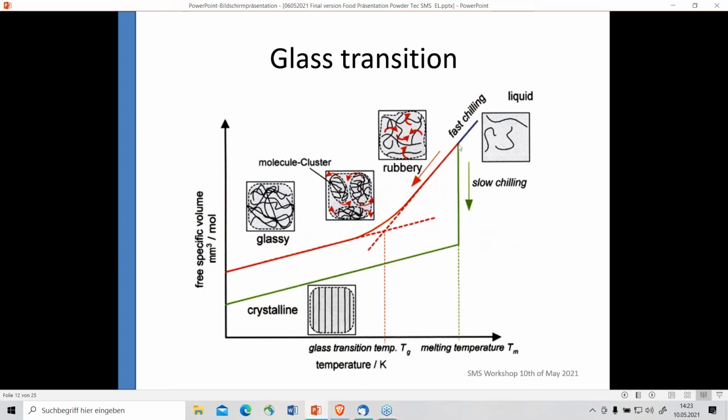You cannot say what's the right or the wrong way. It could be a really good fine crystallization, or, from the same melt, you will go to a glassy state, or the glass transition. And it's up to you and up to the powder what happens in this case.